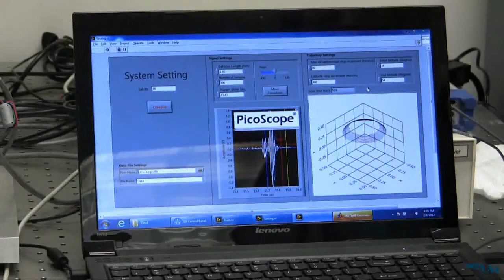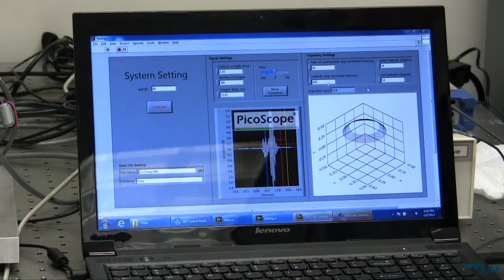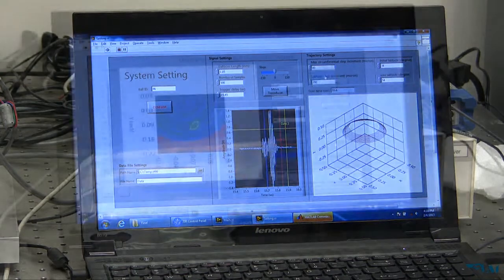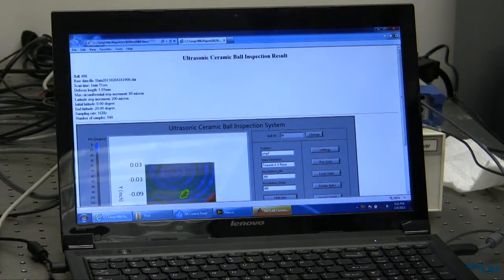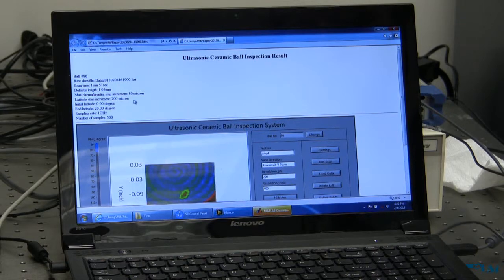A fine scan can be performed to further confirm the crack and estimate its size. Finally, user can click the Generate Report button to generate an HTML format document containing the ball ID, test parameters, and a scanned image. This report is saved along with the data files.